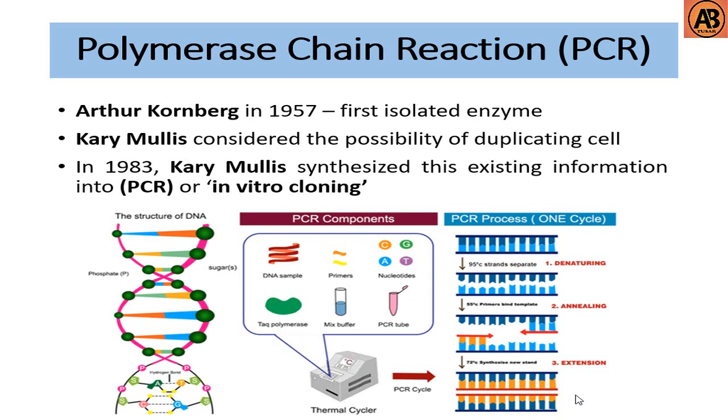In this video we're going to learn about the PCR, that means polymerase chain reaction. So polymerase chain reaction or PCR is a method of making unlimited copies of DNA using a test tube, a heat source, and a few simple reagents such as template, primers, DNA polymerase, deoxyribonucleoside triphosphate, and buffer.